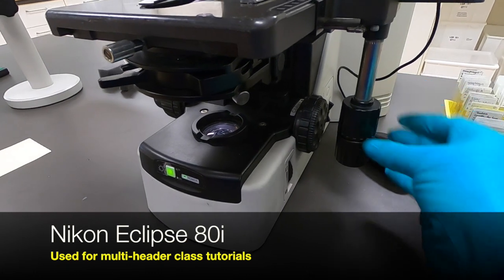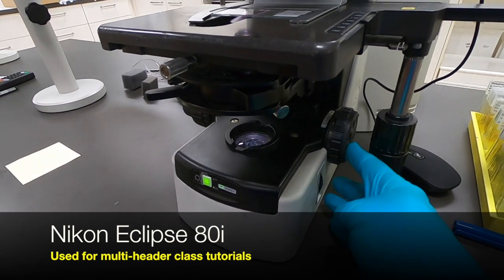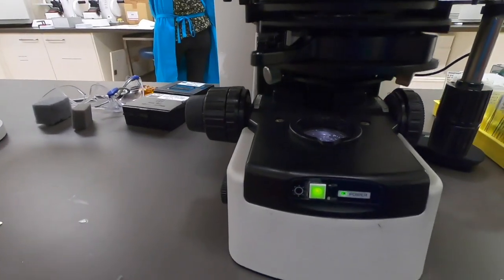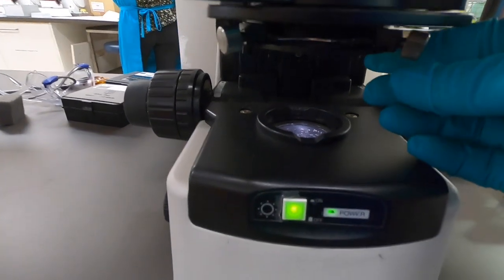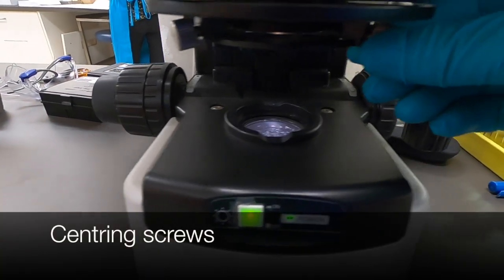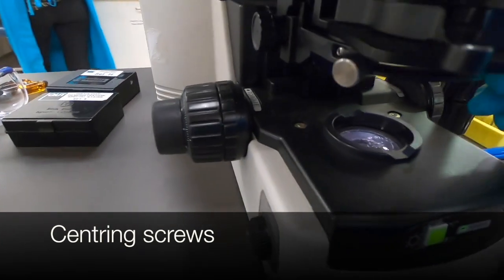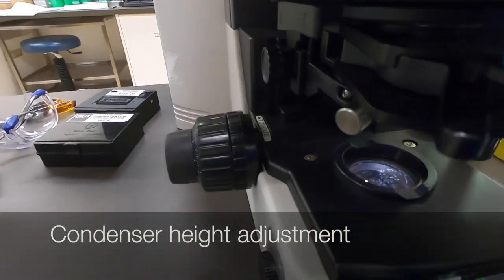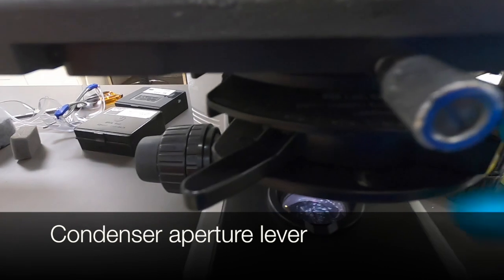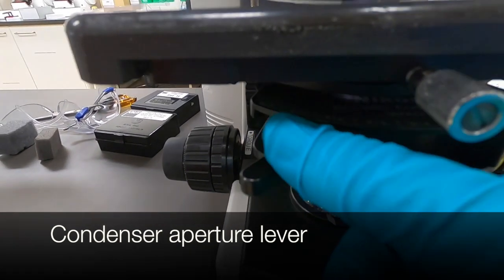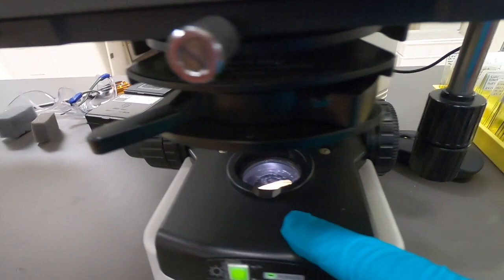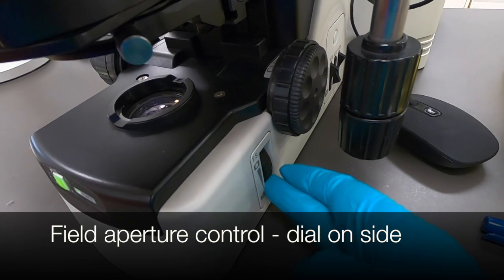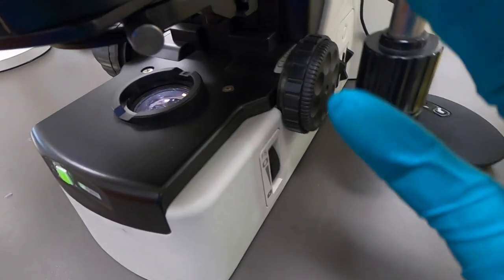And then finally, moving to the Nikon Eclipse 80i microscope, this is the one attached to our multi-header. Again, we've got the usual control over stage and focus. If we now have a look underneath, we can see we've got some centering screws for the condenser, the condenser height adjustment, and a lever for controlling the aperture of the condenser. Doesn't appear to be any field diaphragm aperture adjustment there, but down on the side here, we've got a dial for producing the same result.